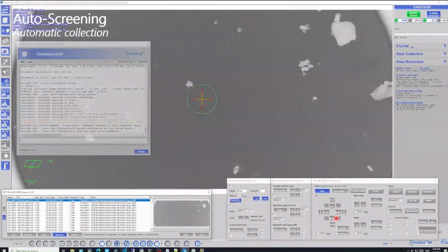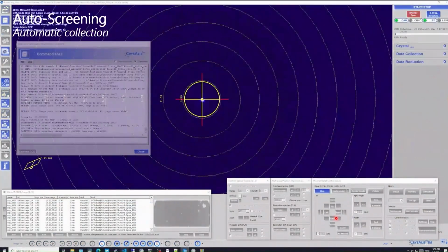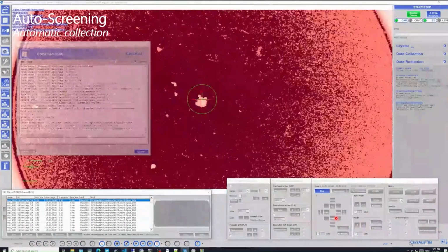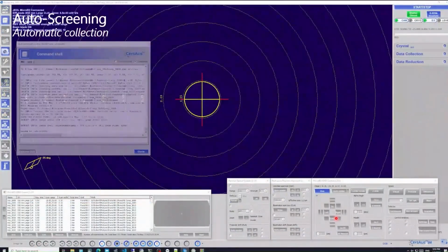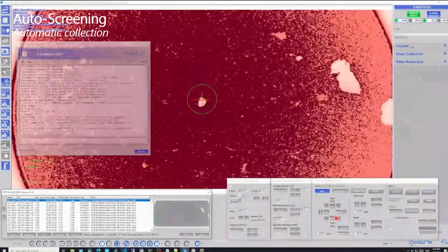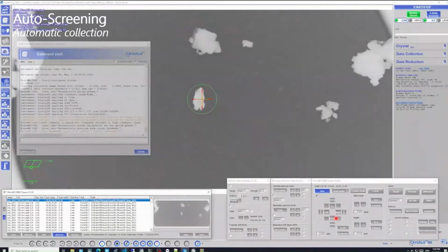And when you come back to the machine, hopefully you have a few hundreds of data sets with their unit cell parameters, and maybe even with several structures, and you can identify whether you have polymorphs and if so, what they are. And again, this is really important at any stage of drug research, including for those very first solids that you get when you first try to crystallize new compounds. Remember, just one or a couple of those submicron particles may suffice to get a crystal structure.